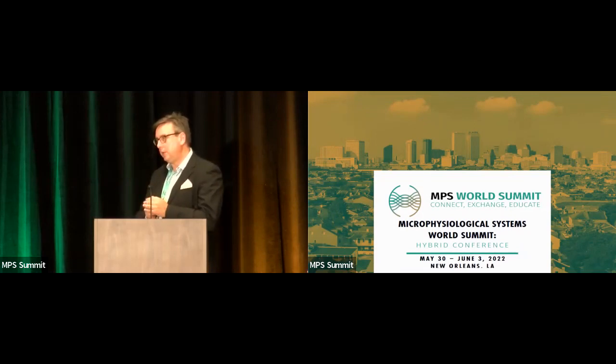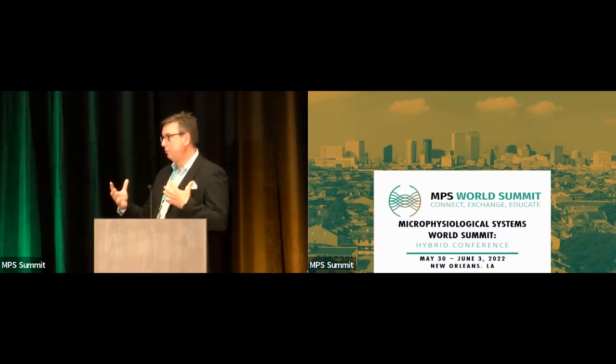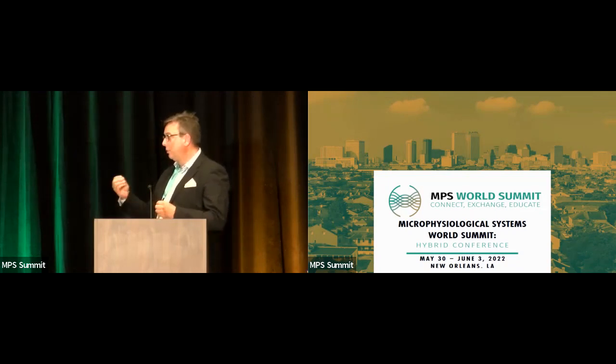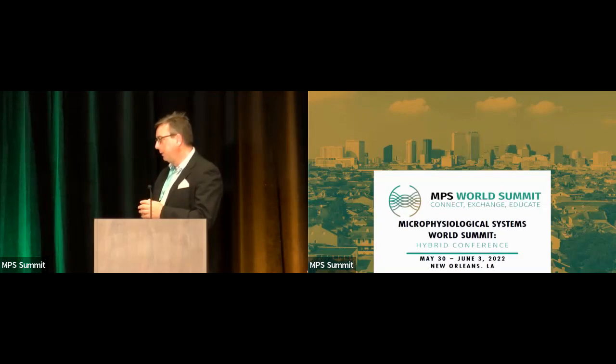Olivier and his team and our colleagues at ETH have done quite a lot of computational fluidics analysis. So it really depends on the cell size versus medium volume that you would really see a depletion of specific nutrients or an increase of, let's say, metabolic byproducts, right? But this definitely plays a role.